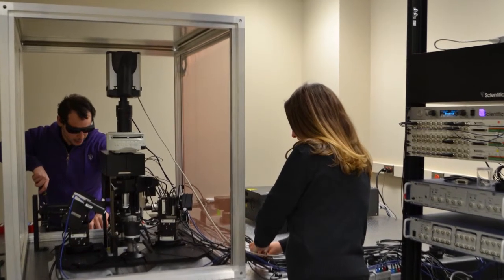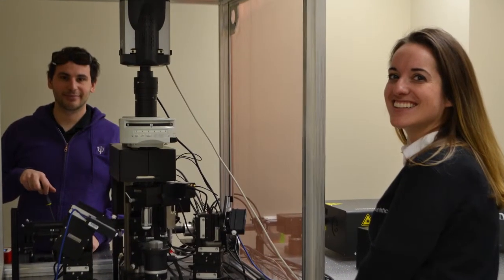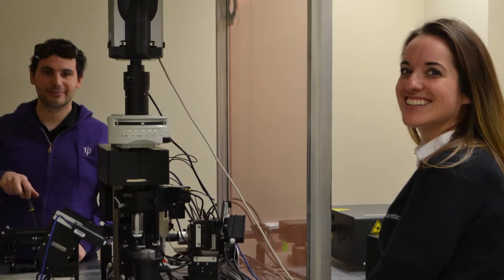I know there's a number of individuals in cancer research. One person has developed a three-dimensional cell culture model of breast cancer. She's been having a lot of trouble imaging throughout the entire depth of that sample, so she's super excited to get this multiphoton work on board. Another person wants to do some 3D imaging of brain tumors, and the infrastructure has not been there. So I think bringing this here will see an immediate impact on not only our research, but the research quality from other researchers at MUN, as well as the quality of our grant applications. I think it will increase the competitive nature of our grants.